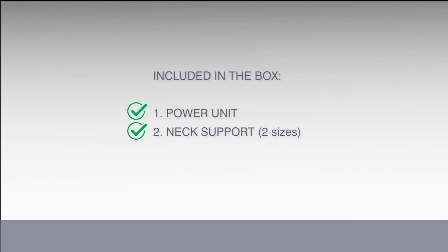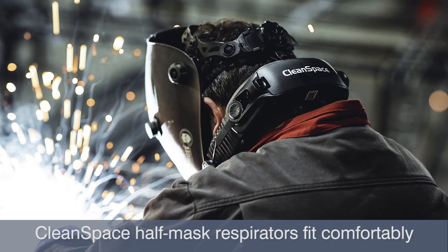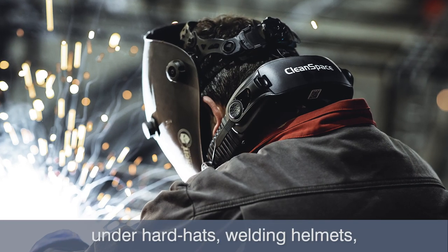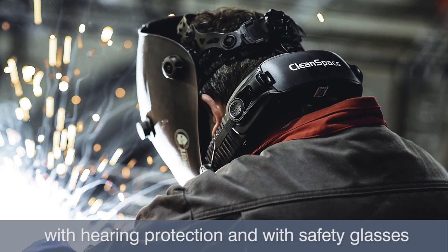Included in the box is the power unit, neck support, battery charger, carry bag and quick start user guide. CleanSpace half mask respirators fit comfortably under hard hats, welding helmets with hearing protection and with safety glasses.